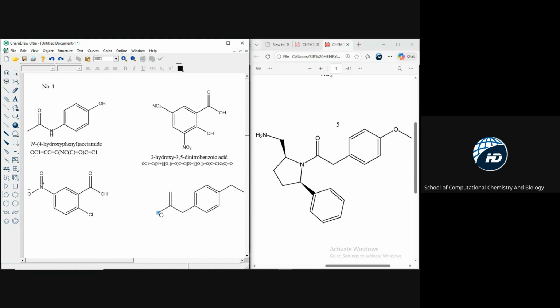Before you click, you can hold your left mouse and adjust the position to see how it will suit what you want to do. You can also rotate it, so whichever be the case, depending on what you encounter.